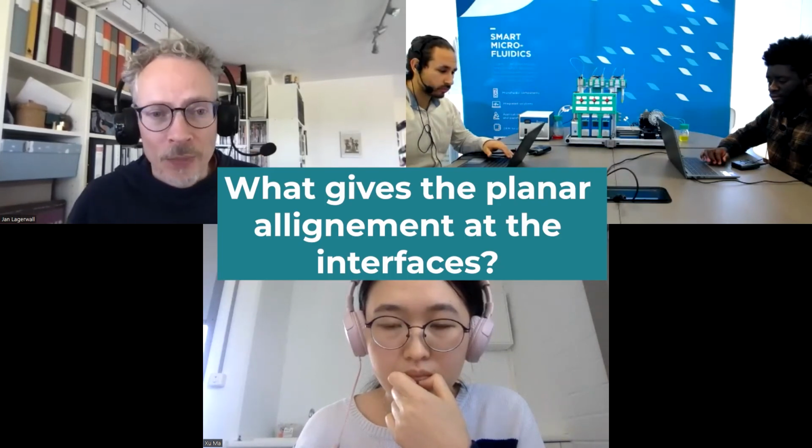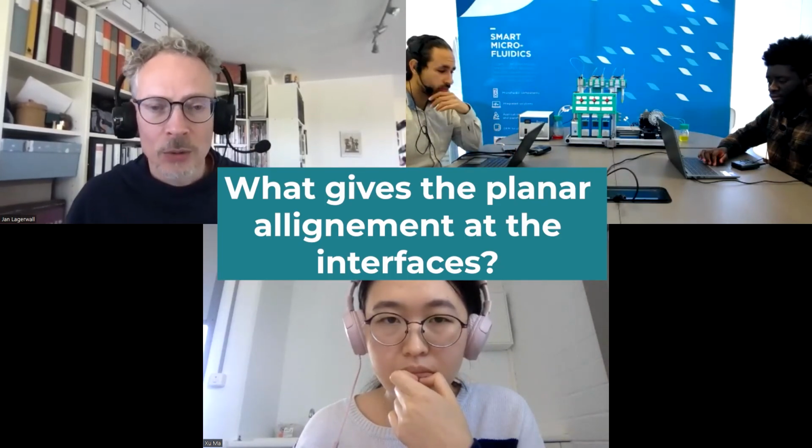Now, in addition, we add polyvinyl alcohol to the water phase, and that is mainly for stabilizing the shells to make sure that they don't collapse into droplets and they don't merge with each other. There is still a discussion of whether the PVA itself is enhancing the planar alignment or not. I think it's not a big deal. I think the main issue is water. Of course, the best solution for stabilizing is to use surfactants.